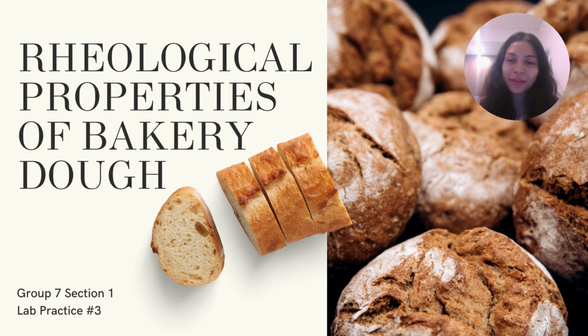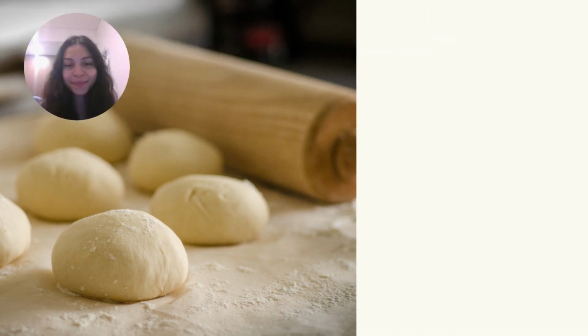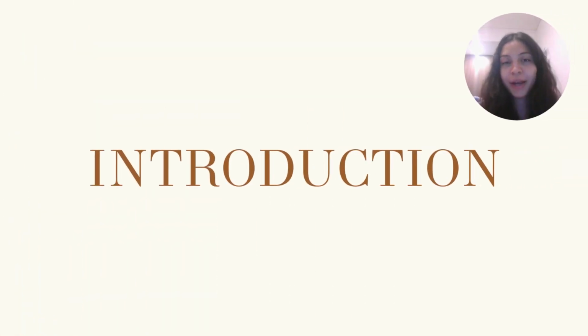Welcome, we're group 7 from section 1, and this is our third lab practice, and it's about bakery dough and its rheological properties. The content of this practice has been divided in several sections, which are introduction, methodology, results, discussion, and conclusions. In this introduction, we will talk about bread and how its components can alter its rheological properties.